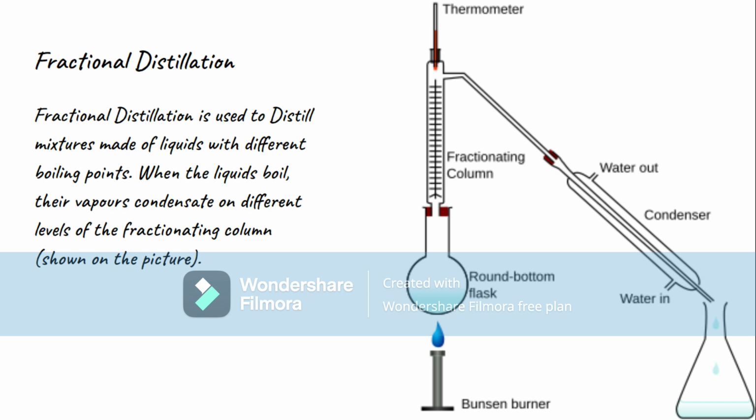So now that we know the most basic type of distillation, let's go into the more confusing territory. The next type of distillation we are going to talk about is fractional. Fractional distillation only differs from simple in the fact that it has a fractionating column, which is, quote, a piece of glassware used to separate vaporized liquid mixtures of liquid compounds with close volatility.